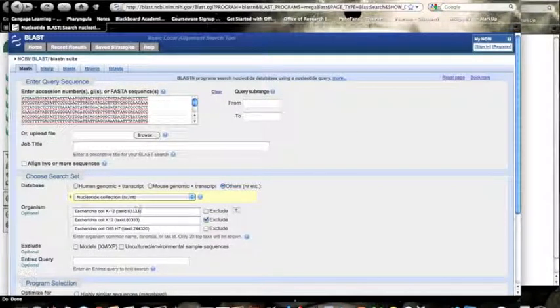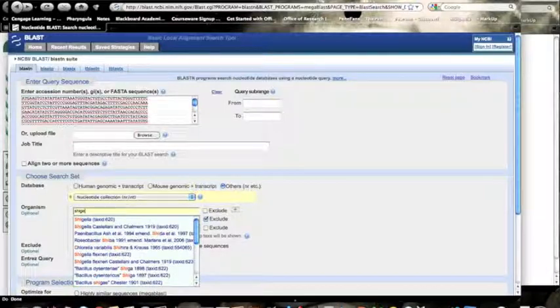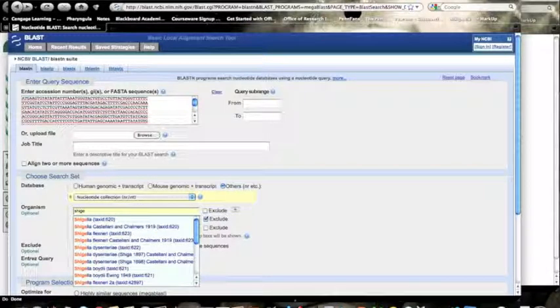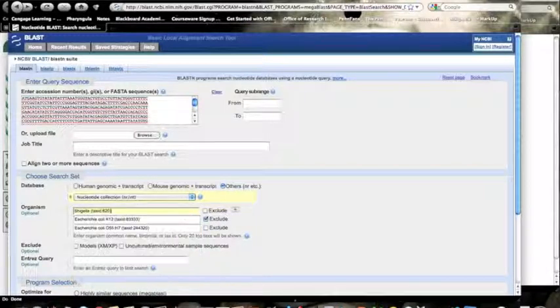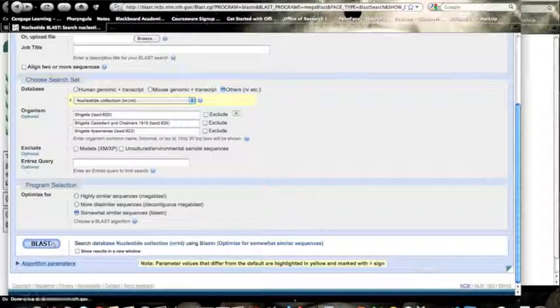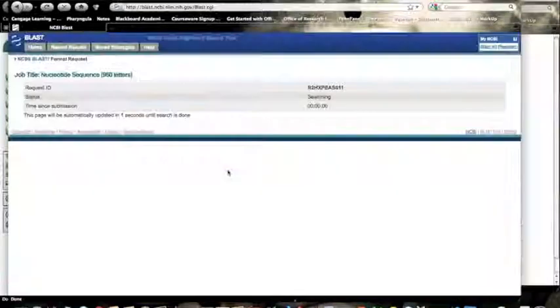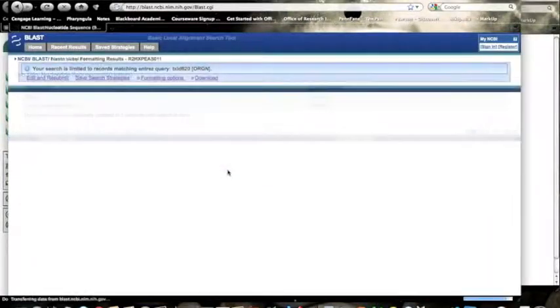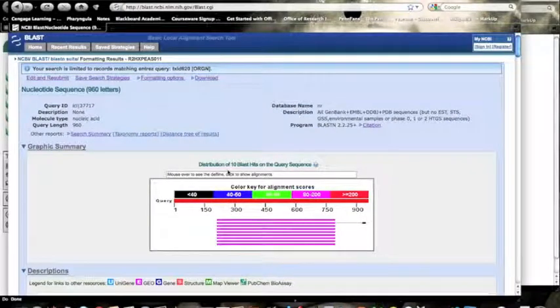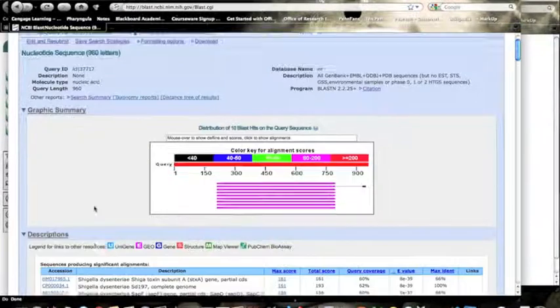We might want to instead change it to Shigella, for example, which is where the term Shiga toxin came from. And there we go. We take a look, and we've got pretty good similarity here.